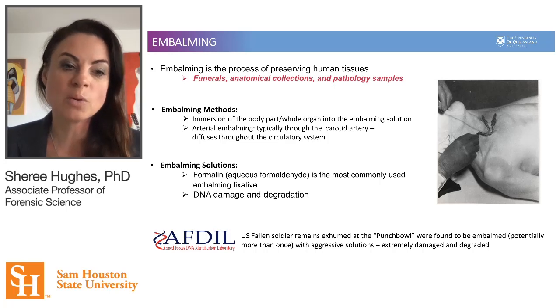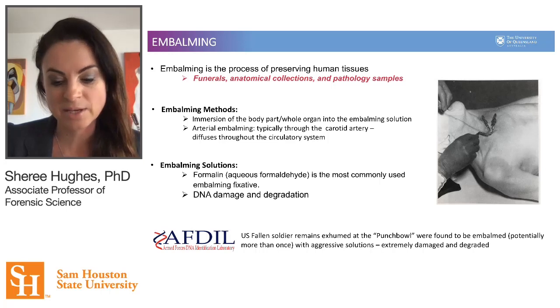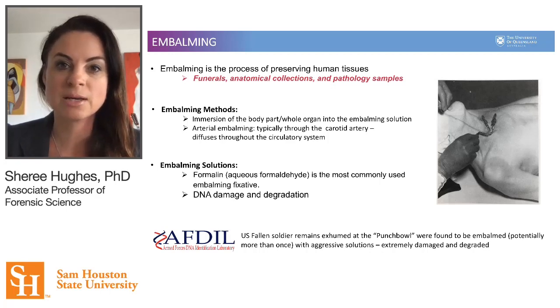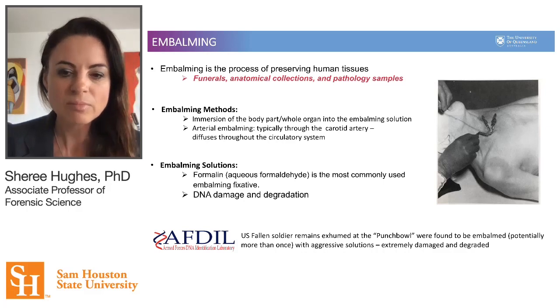As most of us would be aware, AFDL have also encountered this problem with a lot of their remains that they've recovered, their skeletons and bones from the Punchbowl, where these bones we know have been immersed in really, really aggressive formalin-based embalming solutions and powders.